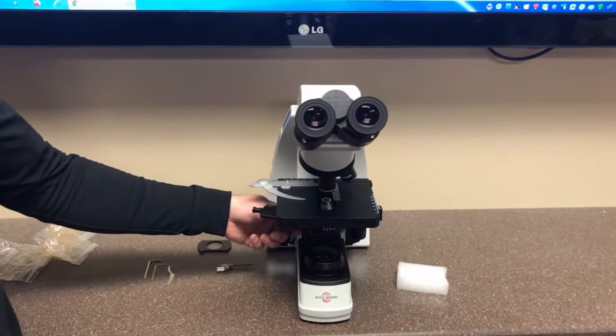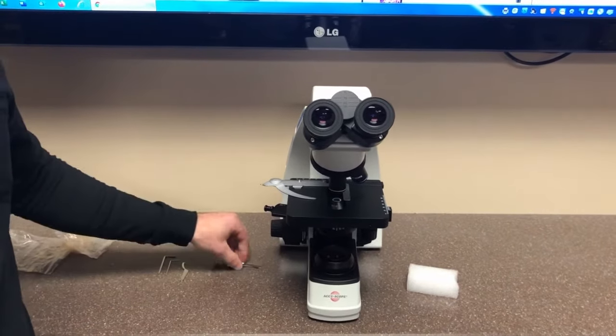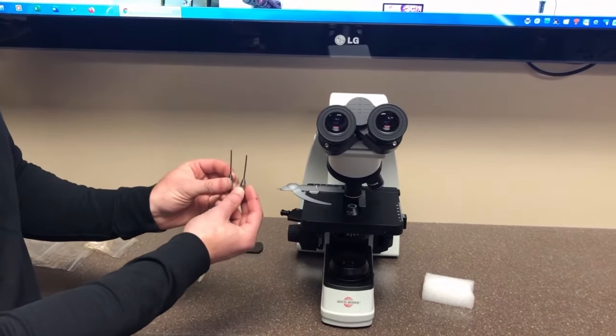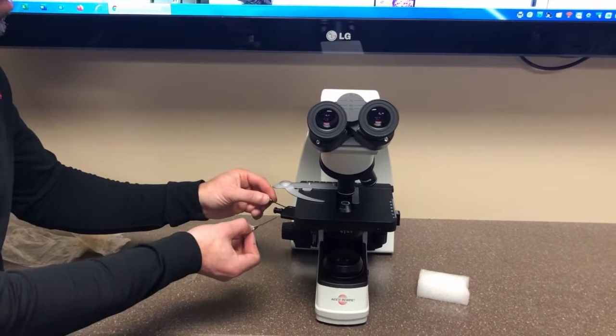The slider is pre-centered and pre-aligned, so it should be set for phase. However, if you need to center the slider and the annulus, there are two centering tools that go into the end of the slider.